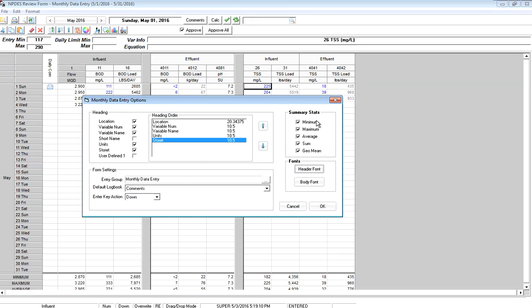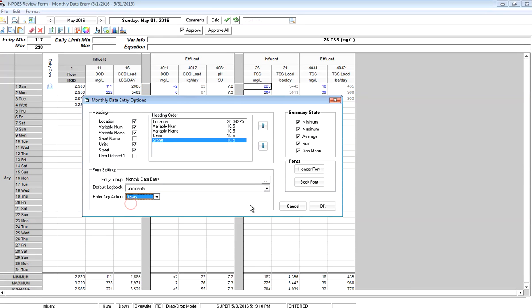It also allows me to select what summary stats are shown at the bottom, what entry group I'm going to be in, what logbook I'm going to use, and when I hit the Enter key, does the cursor go down or across? In this case, I'll leave it at down. I'll go ahead and click OK.